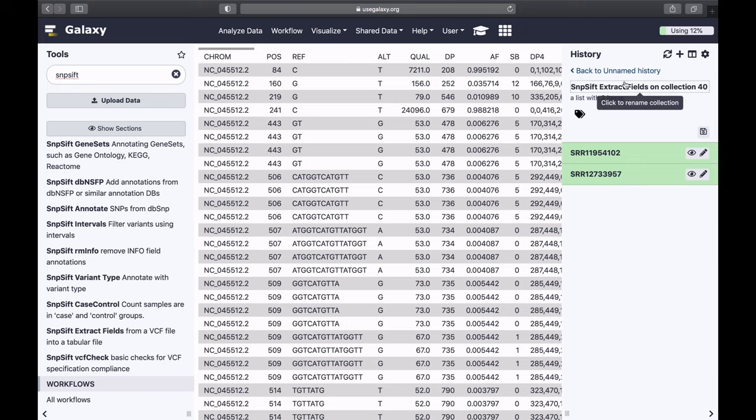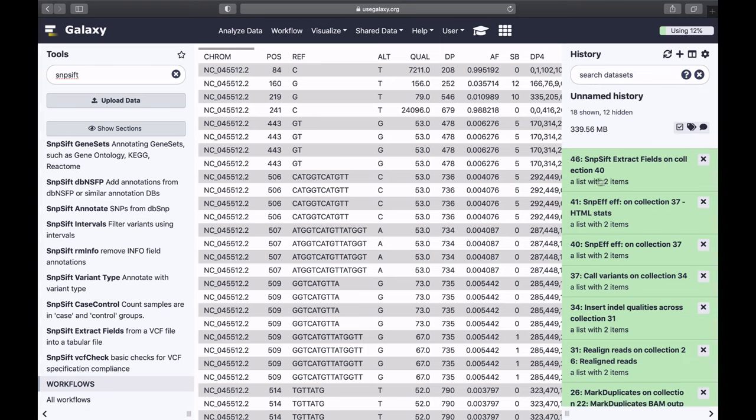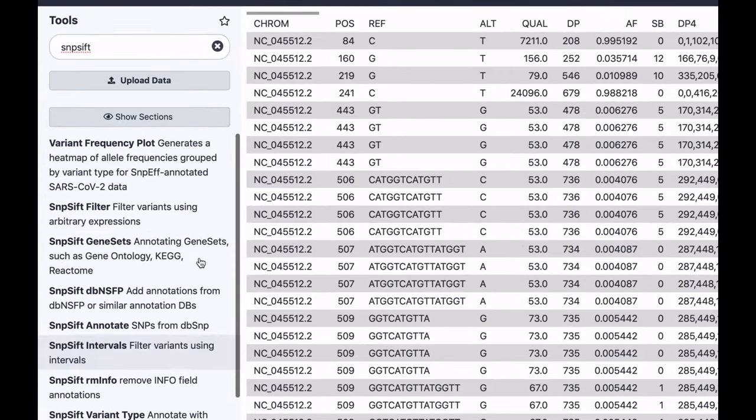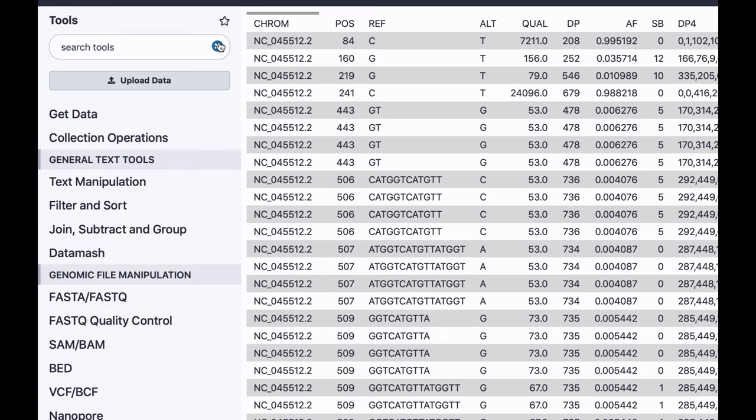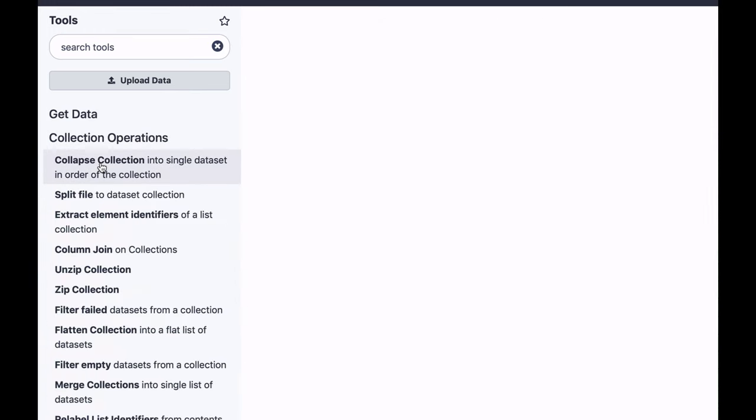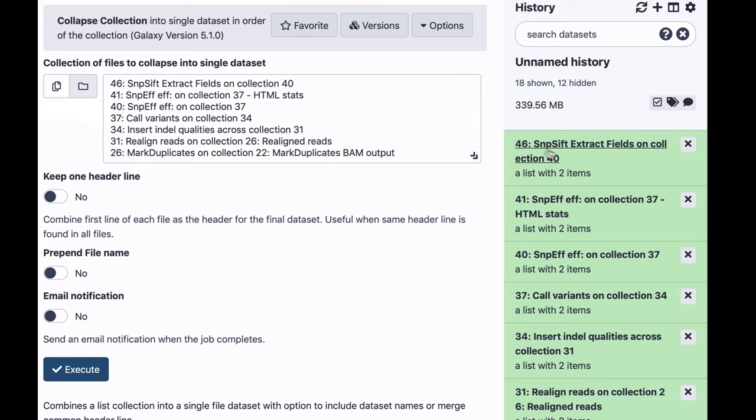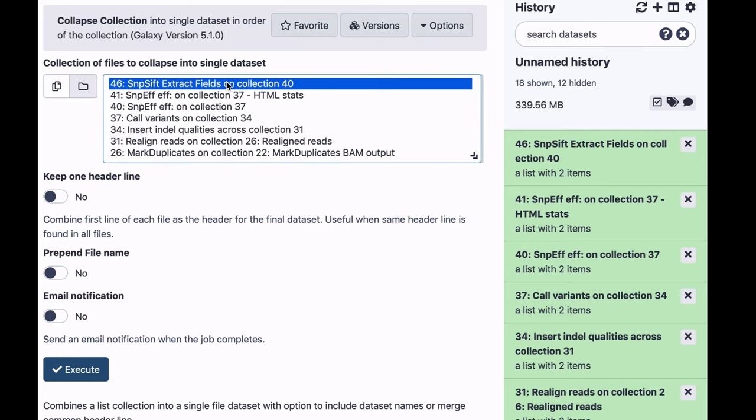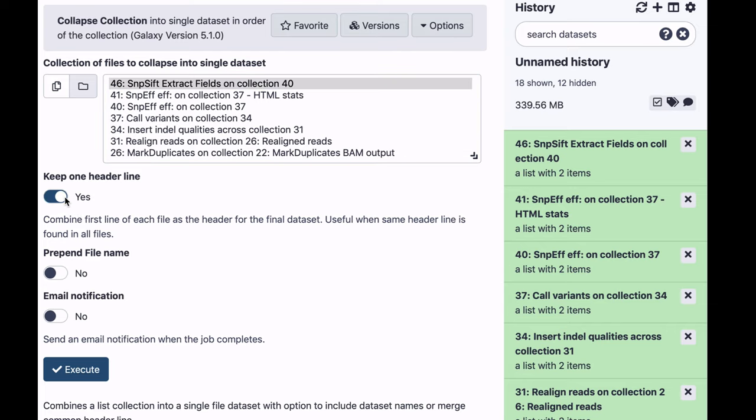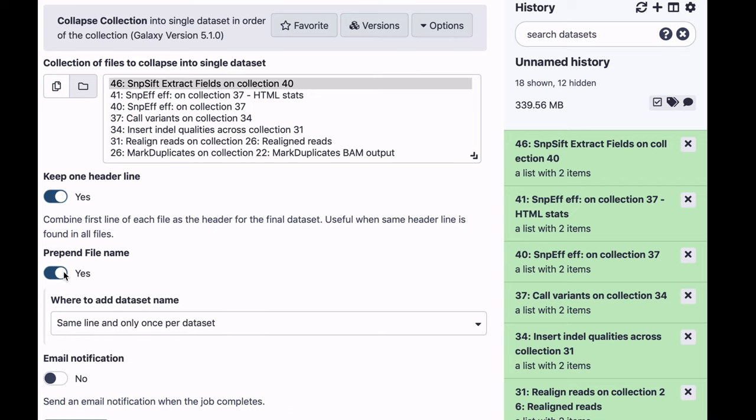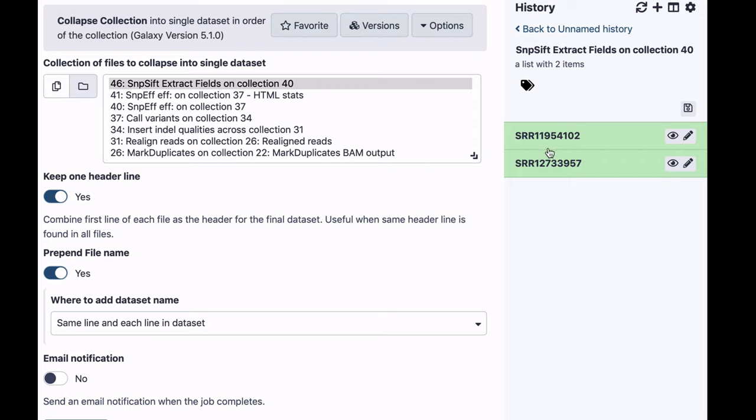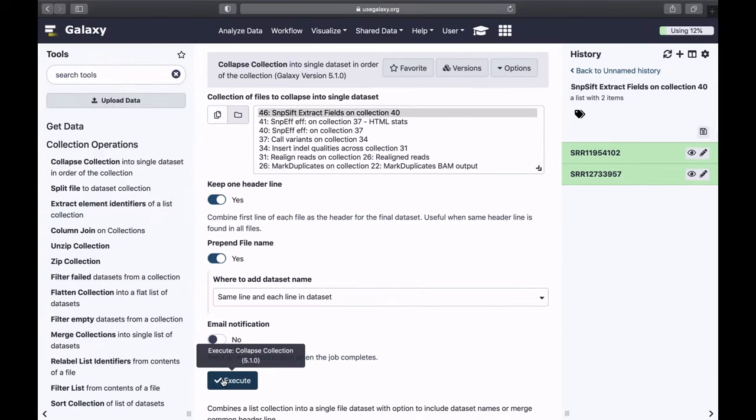So in order to convert this, it's a collection, I need to collapse it. And I will go to collection operations, use collapse collection tool. I will select this collection I want to collapse. I will use one header line, and I will also prepend file name. Same line in each line in data set. This will essentially set the data set name, which is these. It will prepend every line in both data sets with the name of the corresponding data set. For example, everything from here would be prepended with SRR11954102. So let's see what we'll get.